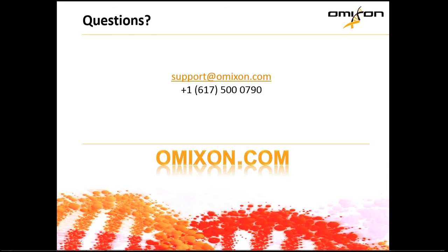We have chosen to use the Pippin Prep because we aim for a wide spectrum of sizes, and usually beads give us restricted size fragments. And you would be forced to do repeated cleanings to select for a wider spectrum of sizes. We also find that this process is not very reproducible. So the Pippin Prep is a better way to identify the needed range of sizes, and that's why we are not using too many of these steps that involve beads. However, we do use them at one earlier step, that is when we concentrate our library, but this is for a different purpose, it's not for size selection.